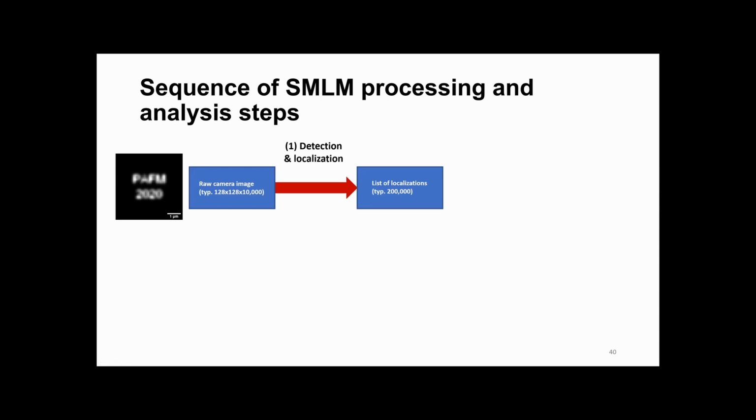Exactly. So if everything's perfect, it would be. But the thing is, you also have aberrations within the entire system. And furthermore, as I've mentioned, you might not have a single emitter but multiple emitters. This is something I will get back to in a couple of slides, maybe even in two, and then it becomes a little bit clearer, because it really depends on how well you've set up the system.